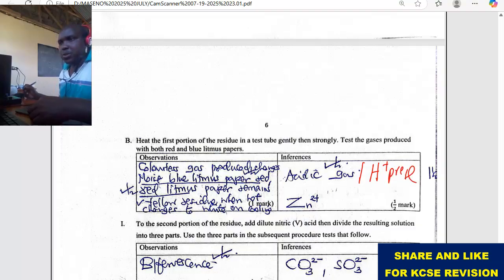Then the yellow residue when hot changes to white on cooling. If the residue is yellow when hot and white on cooling, that is zinc oxide. That's how it behaves. Therefore, you don't write zinc oxide here, you only give the ions present. Therefore, it is zinc 2 ions present, because the compound is zinc 2 oxide, obviously.